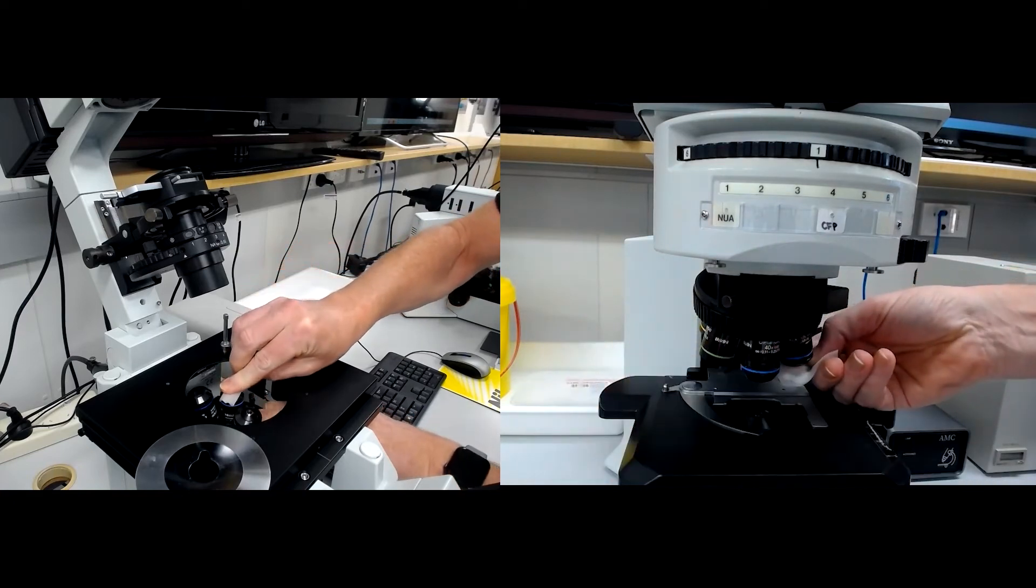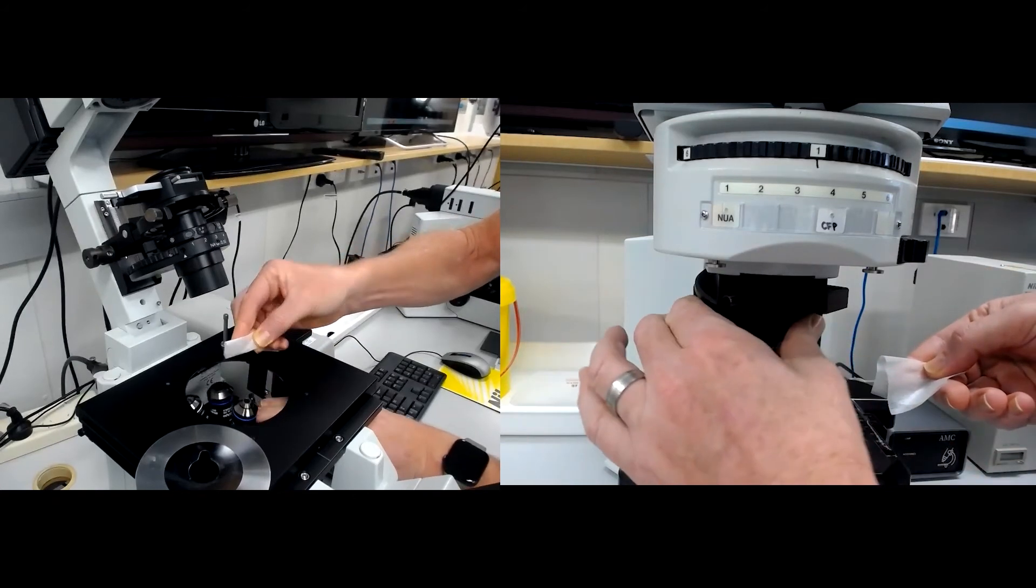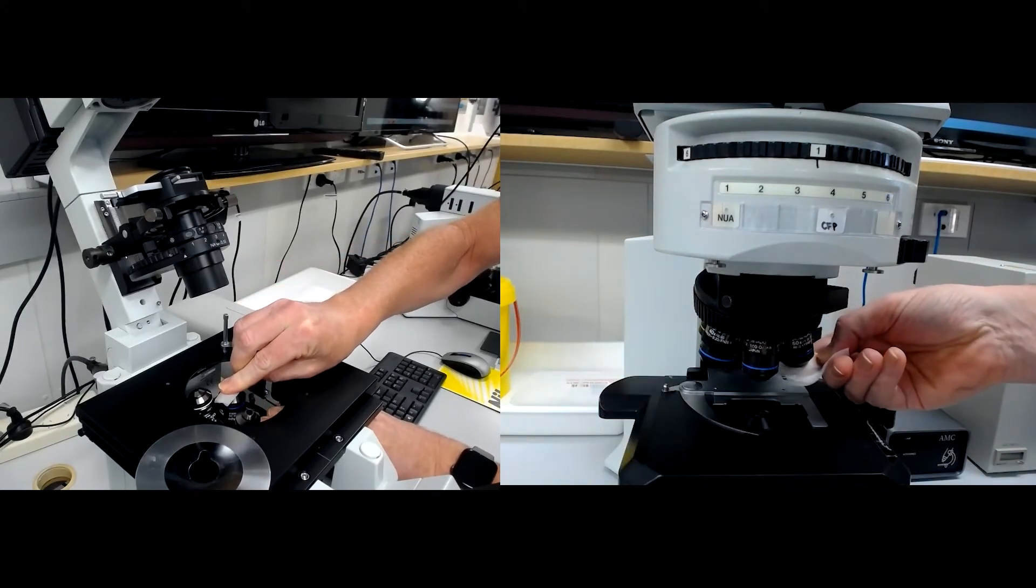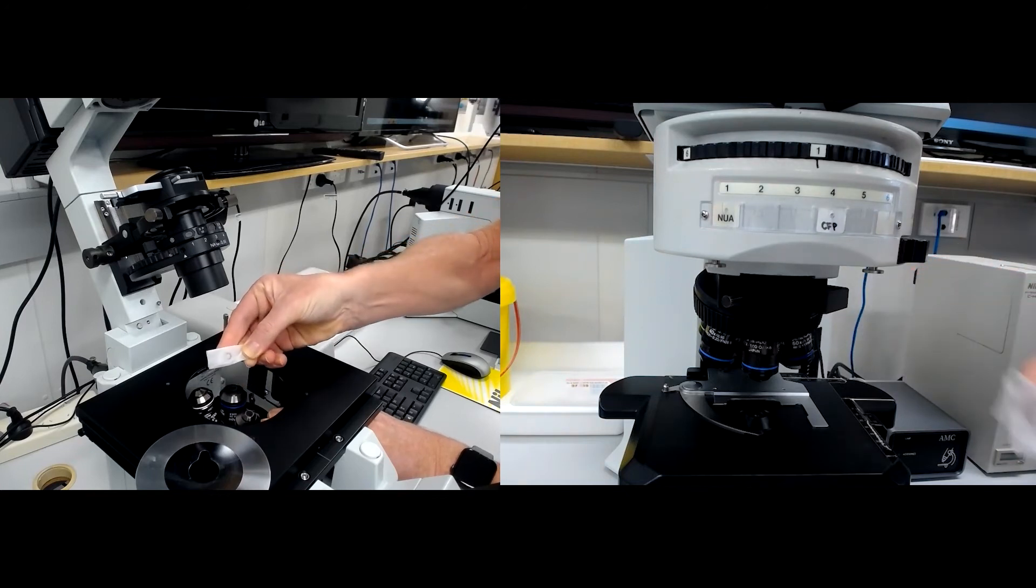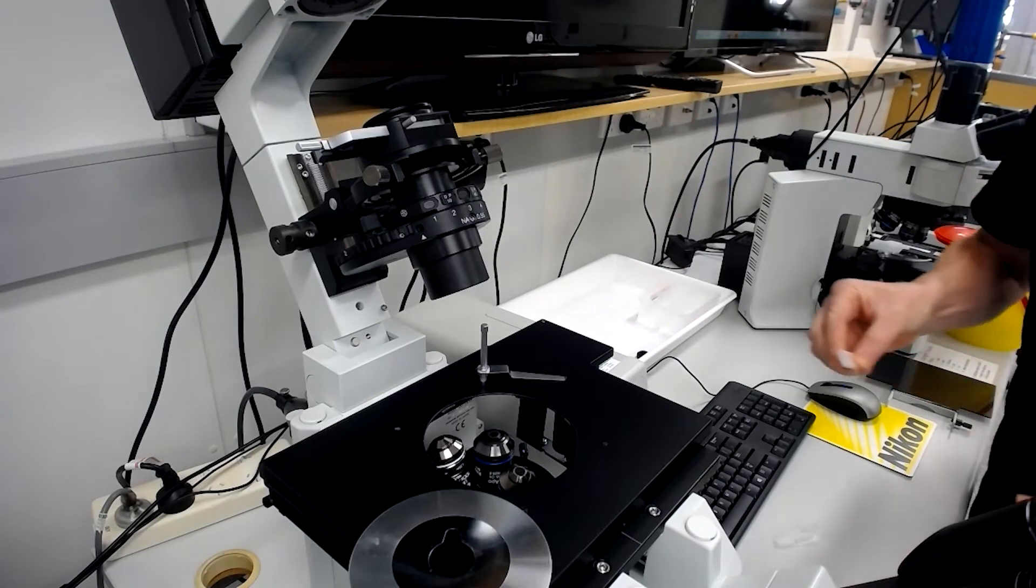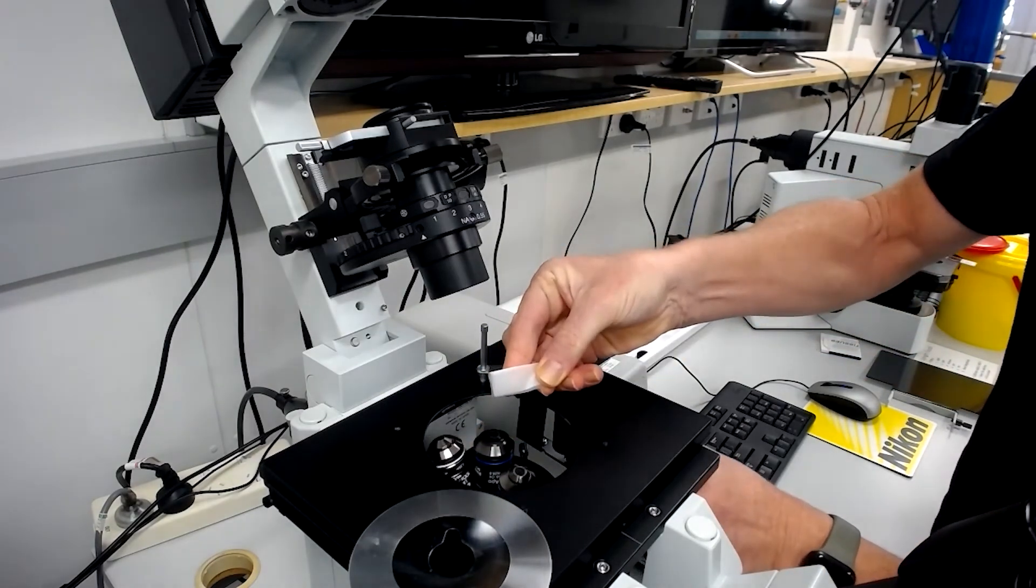Check that the tissue does not have any oil residue. If it does, get a new piece of lens tissue and repeat the cleaning process. It should not have any oil after the second pass, but if it does, get a new tissue and repeat the process.